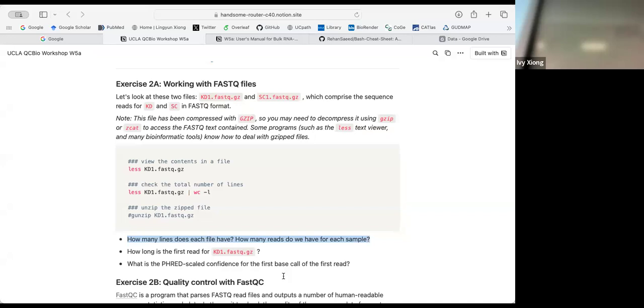Oh, there is another data in the data folder. Oh, okay. Right, so that's the folder. It's a different color. I think what happened is you copied the thing into a folder that doesn't exist when you copied it. So there is a file called data.